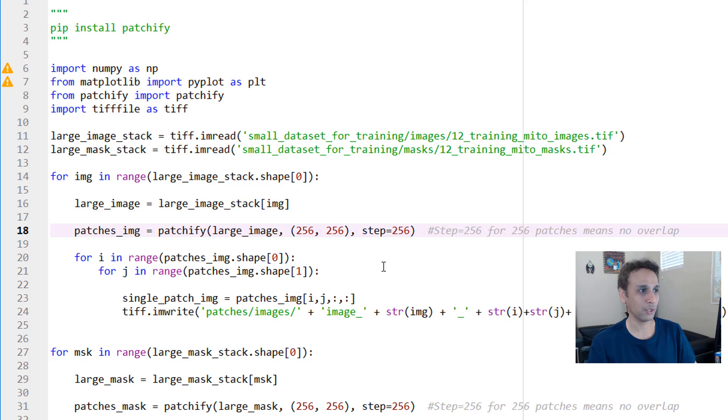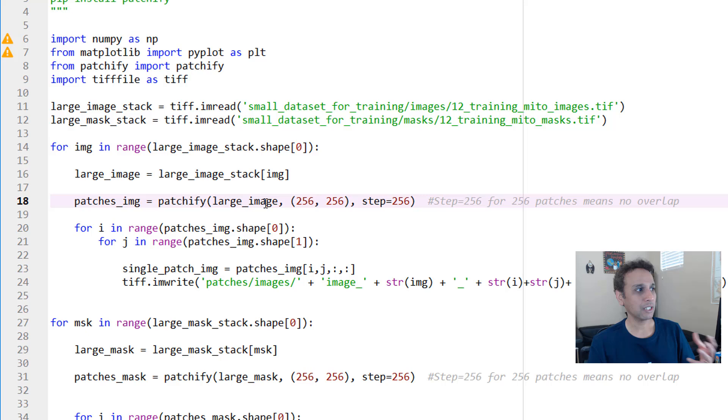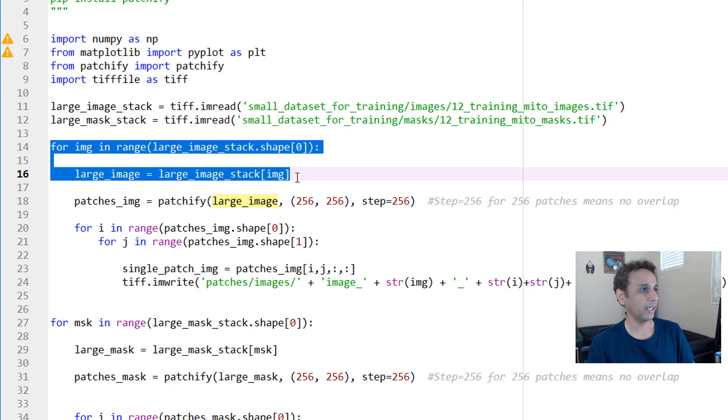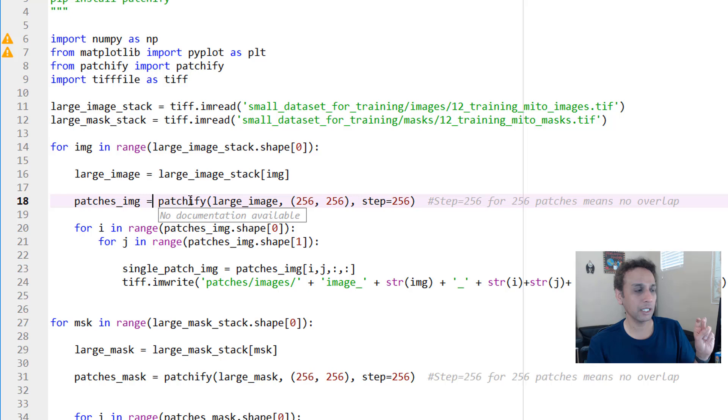Once the patchify is done, let's go ahead and run this single line so you see what patches—oh, actually large_image is not defined. Let's go ahead and define this. I want to make sure you see, okay, my large_image is a single large image, 768 by 1024, right? That's what we have.